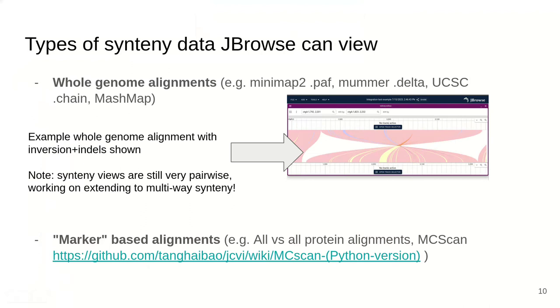One important question we often get is: what types of synteny data can JBrowse2 view? We have two different classes. There are whole genome alignments such as minimap, MUMmer, and UCSC chain files, which can give you per-base detail about what is going on — for example, showing an inversion with deletions and insertions. There are also marker-based alignments, such as all-versus-all BLAST of proteins or MC scan type data, which are very useful for more distantly related organisms.